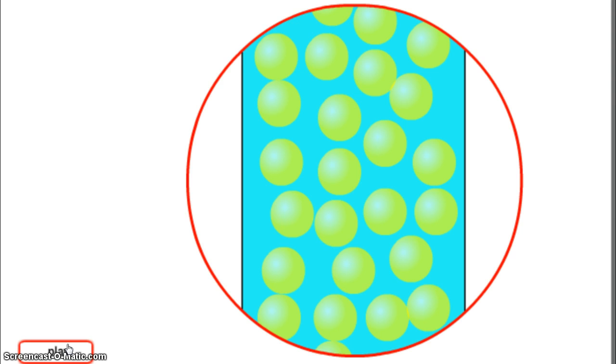As you can see in this picture, we have blue and red components moving through the stationary phase, where the stationary phase are the yellow spheres. They're moving at different speeds in the stationary phase. As you can see, there are different attractions of the two components with the stationary phase. This causes elution at the end of the column to be at different times, and hence their separation. You can see the red molecules eluting first and then the blue molecules afterwards.